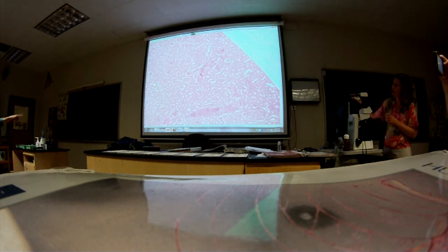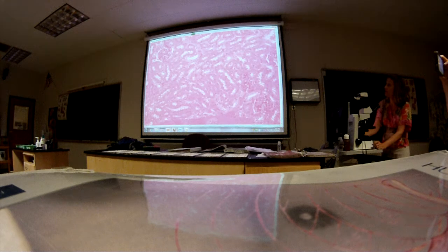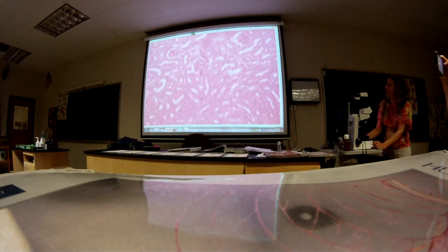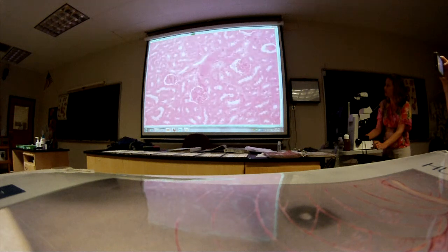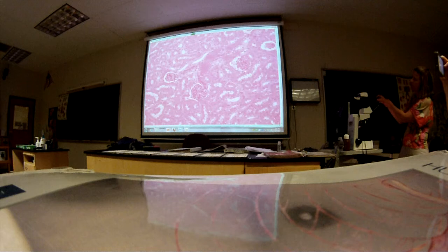Yes. Because you learned it, you're also going to see which of the tubule types? Convoluted. Yeah, the convoluted tubules, distal and proximal. You don't have to distinguish between the two. But this is the renal corpuscle. Remember, renal corpuscle is glomerulus plus the Bowman's capsule.